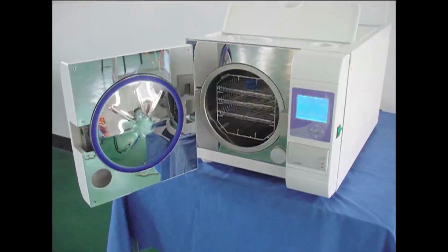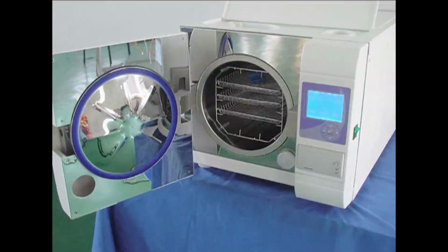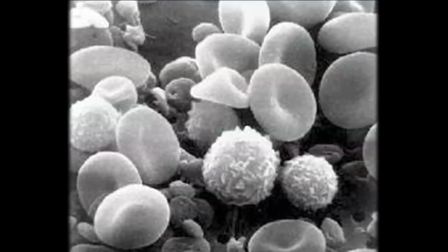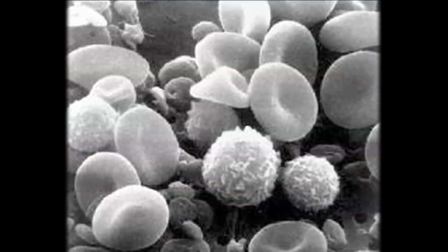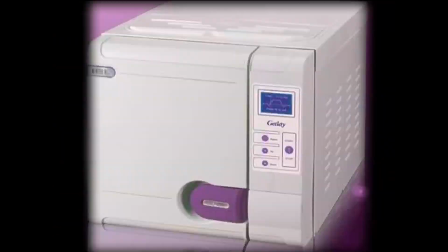So as the things which are getting autoclaved are residing inside that condition for just 4 minutes, the probability of getting the disadvantages of autoclaving, such as developing of rust, is lost. And number two, the prions which were not being killed during normal autoclaves are killed in pre-vacuum autoclaves. After the completion of the autoclaving process, the steam is taken out with the help of some suction methods. So the steam never remains inside the autoclave for a longer duration of time.